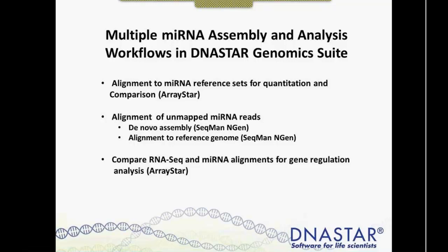The first of these is alignment of microRNA data to reference sets to quantitate and compare different levels of microRNA sequence data. So, for example, you may have multiple individuals or multiple tissue types or developmental time courses, and you want to assess whether or not the microRNA levels are in flux or changing between the different experimental conditions.